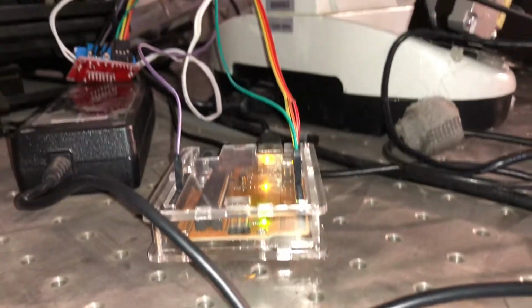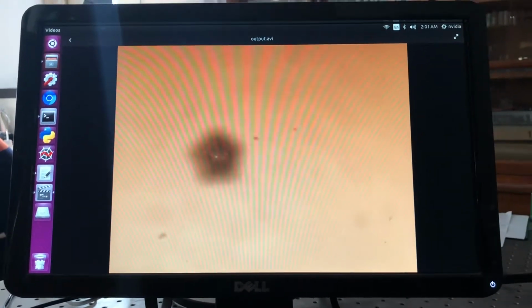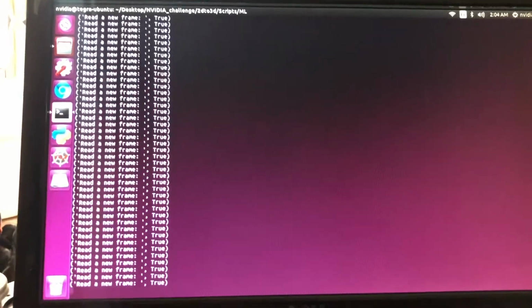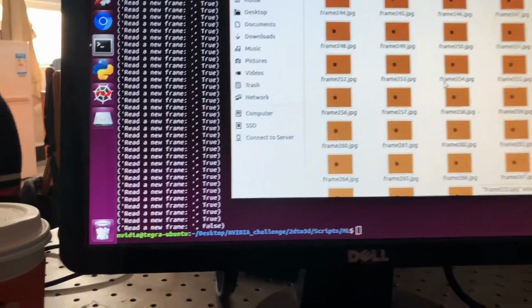Here we customize the microscope using 3 motors and gears. So for the training phase, we use a servo motor to control our knob, and it took a video. Then the video was extracted to JPEG images. So we use those images in the training phases, and also for testing purposes.